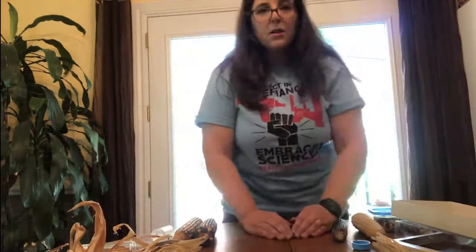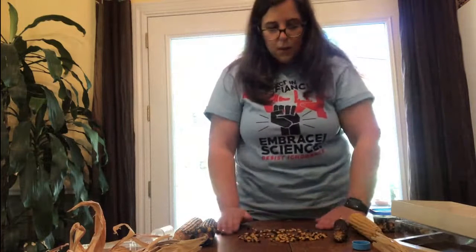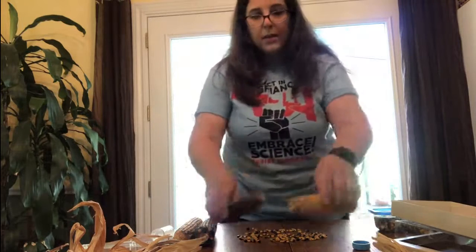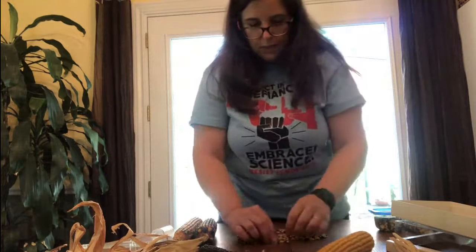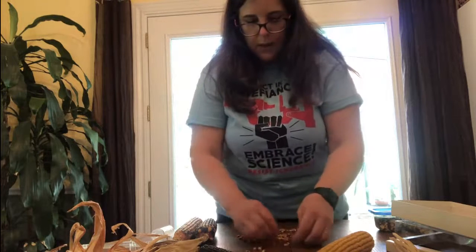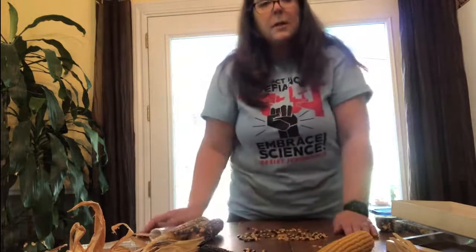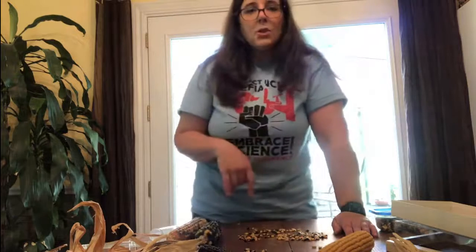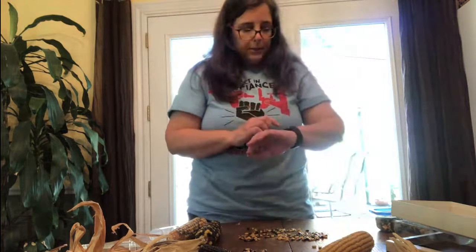But you would take those kernels, and you would sort them according to whether they are pigmented or non-pigmented. And you can use the parents as a guide to help you figure out and count your individual kernels. Now, I'm not going to sit here and make you watch me count all these kernels. So I'm going to count them for you, and then we'll come back to the next segment, which is the dihybrid cross.